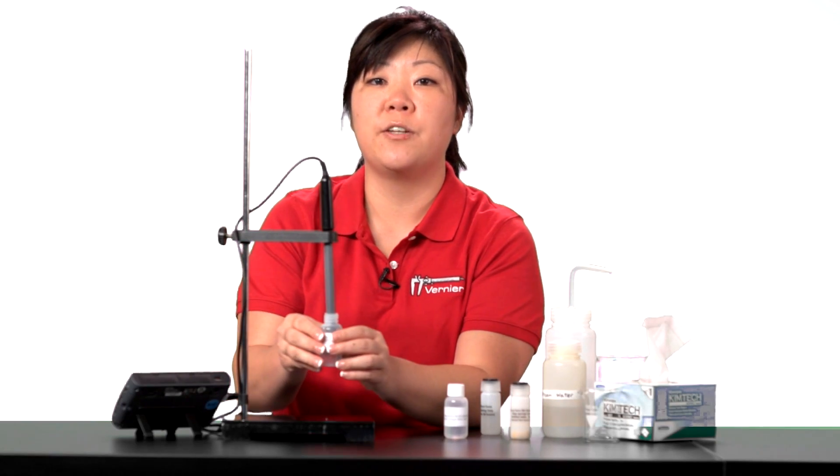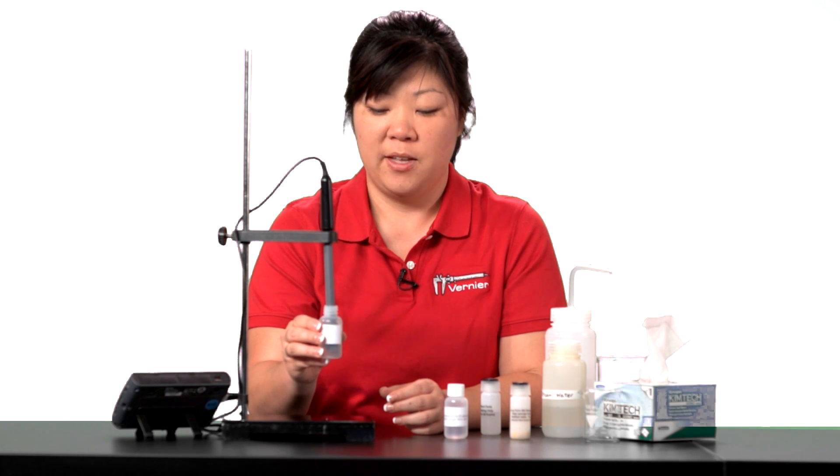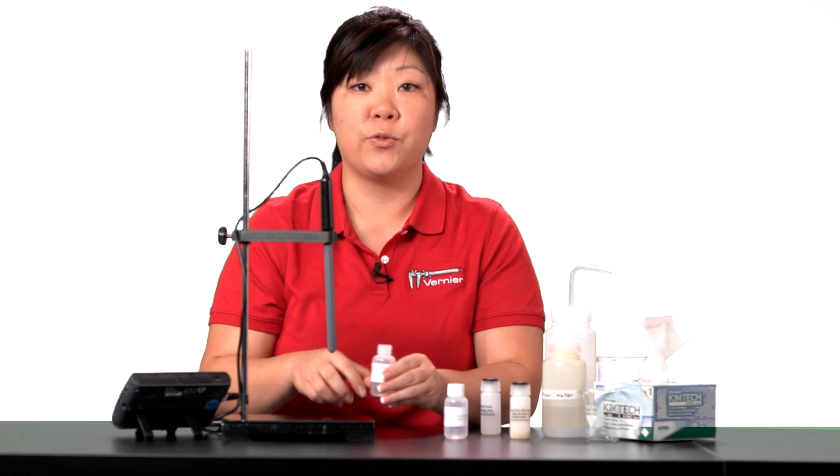This calibration will be good only for several hours. Frequent calibrations will only improve your data. Remove the tip from the low standard and thoroughly rinse before measuring your sample.